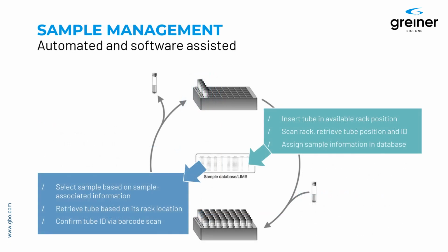So these barcodes, these machine-readable codes, finally allow for a lot of advantages in terms of tracking and traceability of your samples. There are many different concepts available, but I want to show you one example of how such an integration could look like. You could start with racks, where certain tubes are introduced in the racks. And then you do a bulk scanning. You scan at the bottom of the rack, and the data matrix codes are actually shining through because there are bottom holes in the rack. And then you read the individual IDs of the tubes, and you see their position.